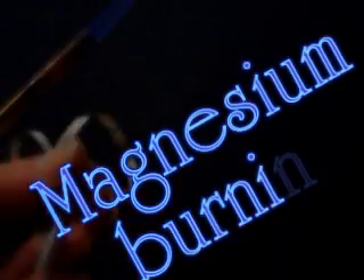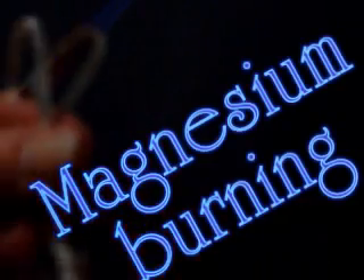This is Magnesium Ribbon, a silver metal. It's malleable and ductile, and I'm going to burn it and we're going to see what products we get.